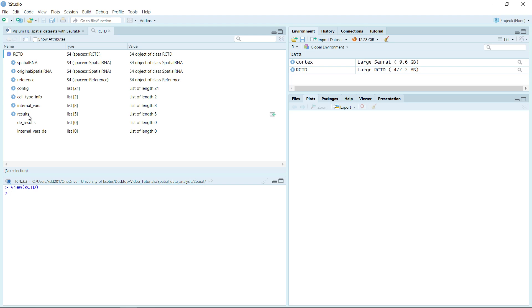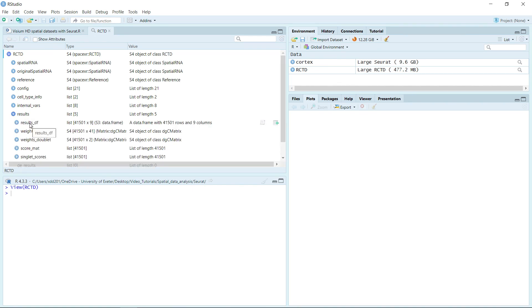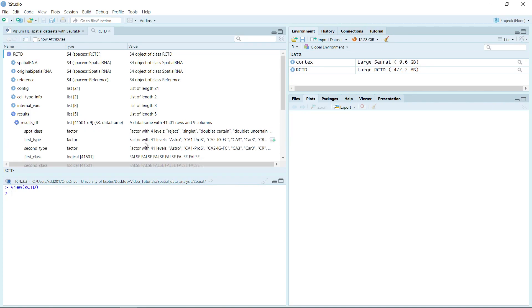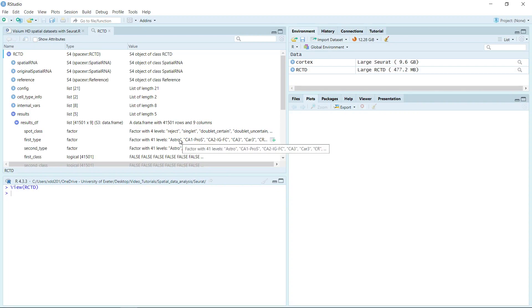You can see now in the result section, we have five lists for the result. In the first list, results data frame, that's where we have the cell types for each cell. In the sketched dataset, you can see we have the first cell type and second cell type. We are going to use the first cell type for the sketched dataset.